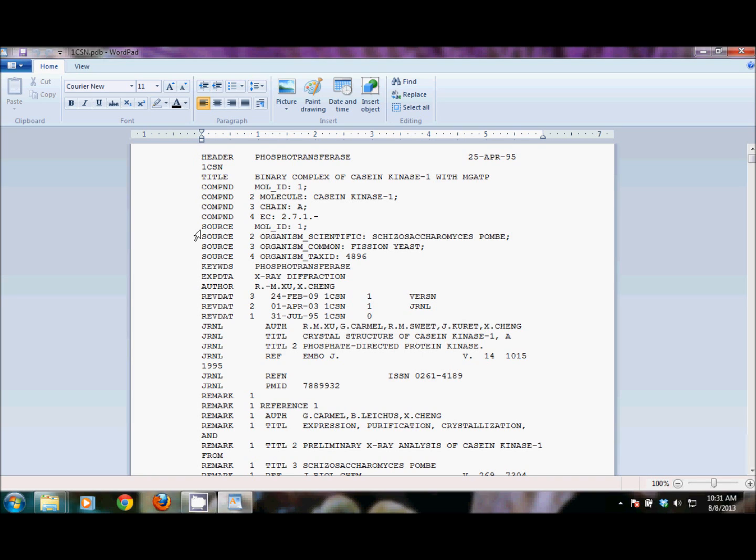There's a section for miscellany. Then there's some crystallographic information. And then there's the main coordinate table, and that's the really important part. The coordinate table contains all of the atoms and amino acids that are part of the structure that you have in the file. And then the file ends with a connection table and some bookkeeping sort of file ending information so that the molecular modeling packages know how to deal with the file.